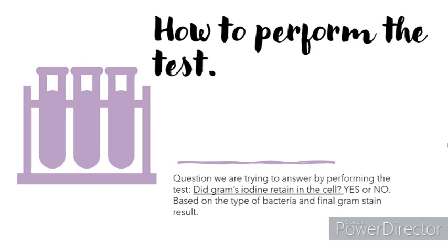How to perform the test. The main question that we're going to ask on this is, are we trying to answer, did Gram's iodine retain in the cell? It's either a yes or a no answer based on the result, the final Gram stain, basically. So I'll get more into that in the next couple of slides.